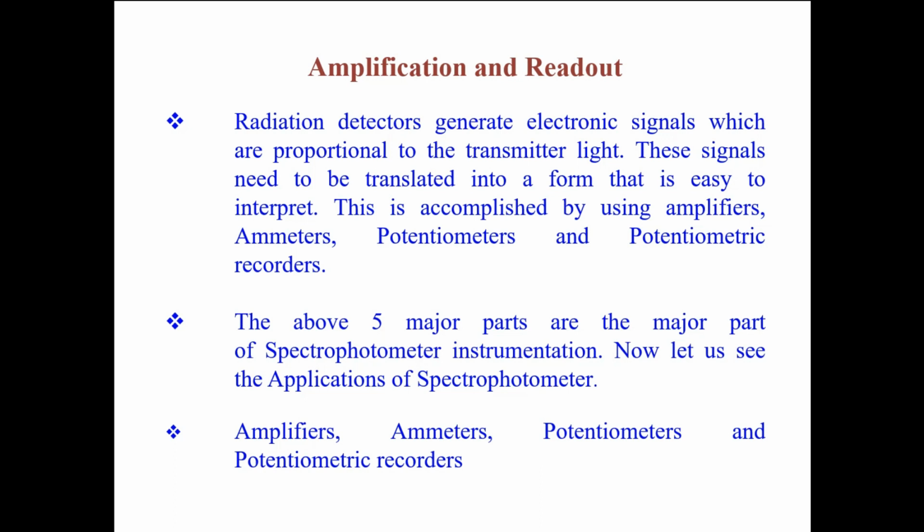So the light source, and the next one is a monochromator, the one which converts the polychromatic light into the monochromatic light. So that also we will see. Okay, so the monochromators are again of two types here. The monochromators will have three types, which we can collectively call wavelength selectors, right? Wavelength will be selected by using this instrument. So that's why wavelength selectors are of three types.